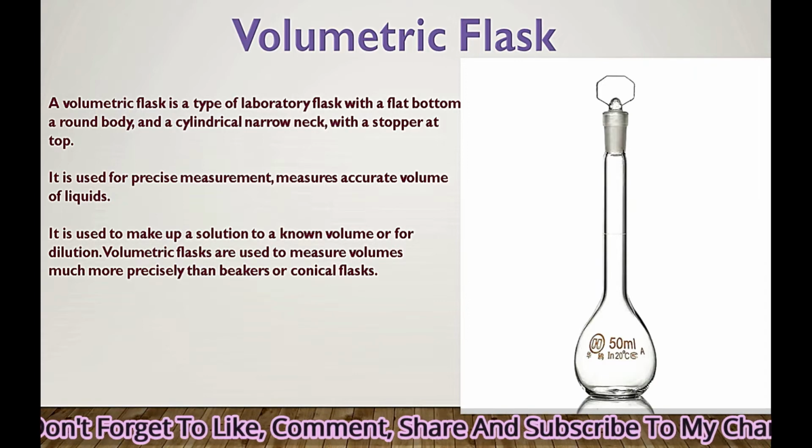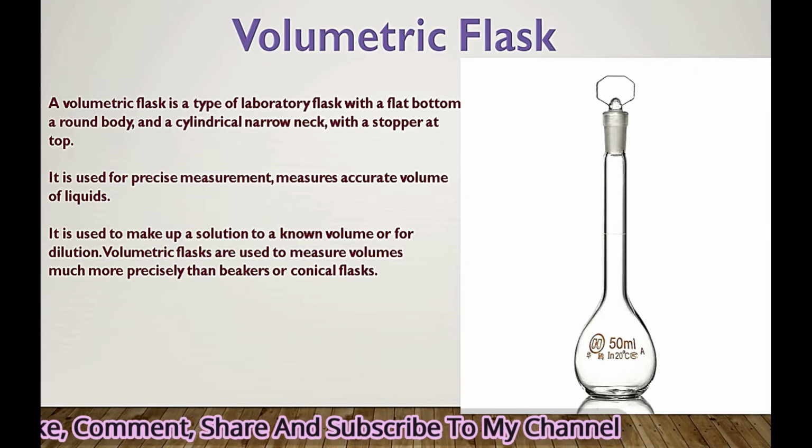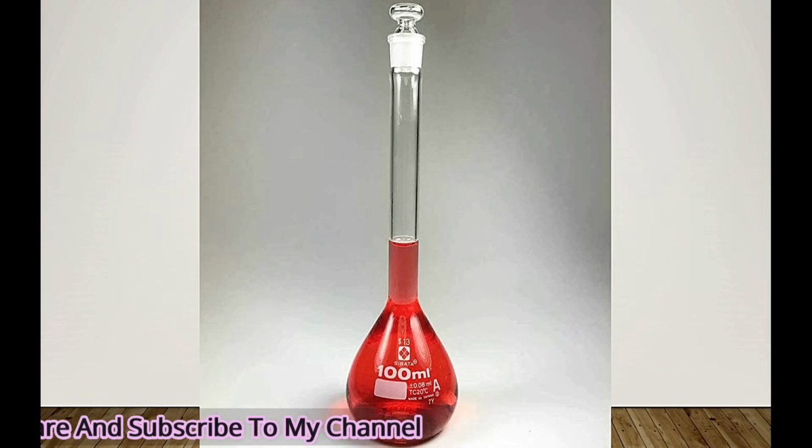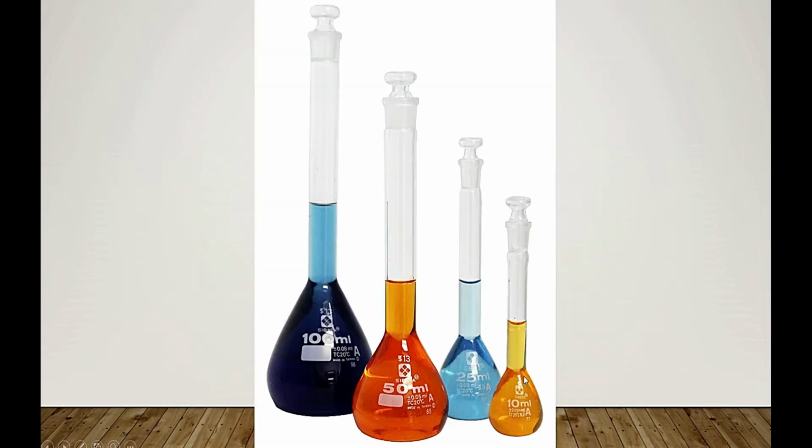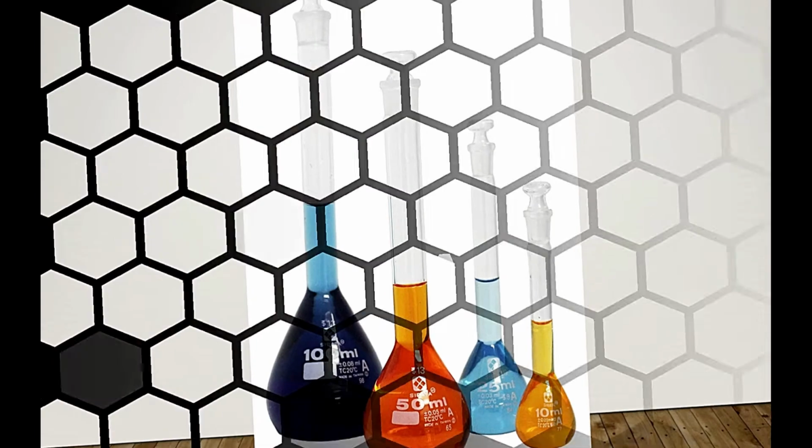It is used to measure volumes much more precisely than beakers or conical flasks. Here you can see the mark is over here, so till here it measures 100 ml because this is a 100 ml volumetric flask. It also comes in so many different sizes according to the use.